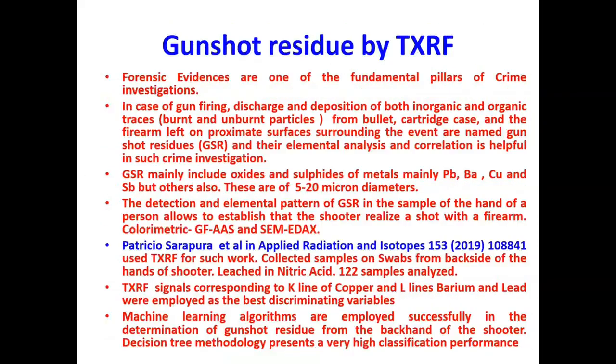Another advantageous application of TXRF, I will say, is in forensic samples. Gunshot residues can be analyzed by TXRF, and in some studies I found it is reported that forensic evidences are one of the fundamental pillars of crime investigation. In case of gun firing, the discharge comes on the back side of the shooter. And if this residue is collected from the back side of the hand, digested and then analyzed, it can give information whether that person has shot the bullet or not.